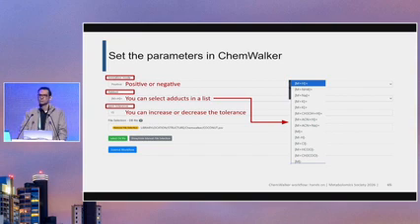That's the idea, but you don't have a set threshold for any of these things. It's going to be dependent on the platform that you're using and on the actual state of your instrument when you're running that data set.